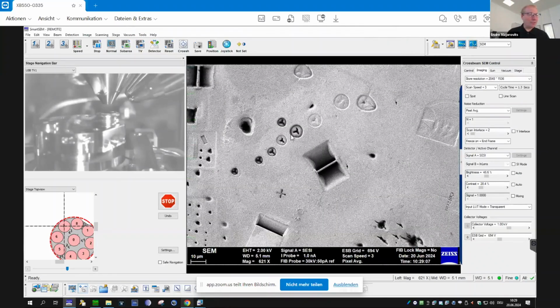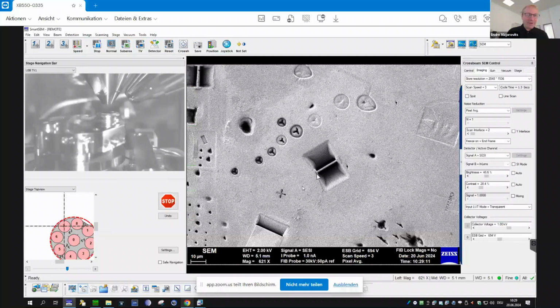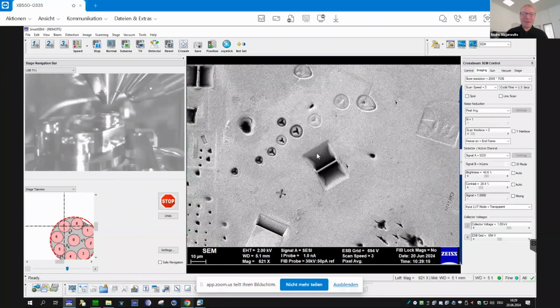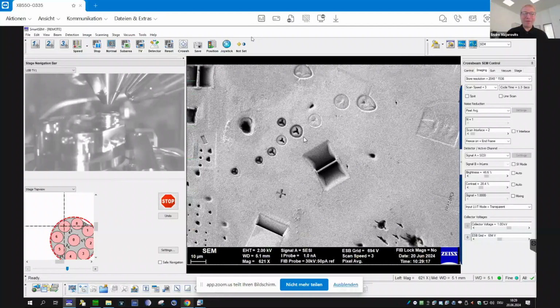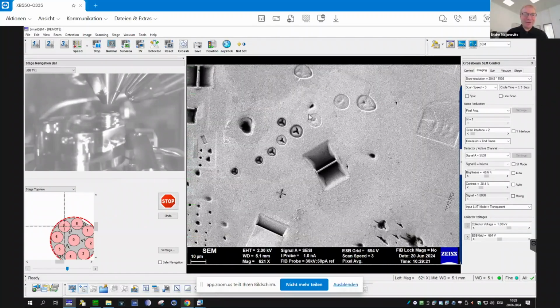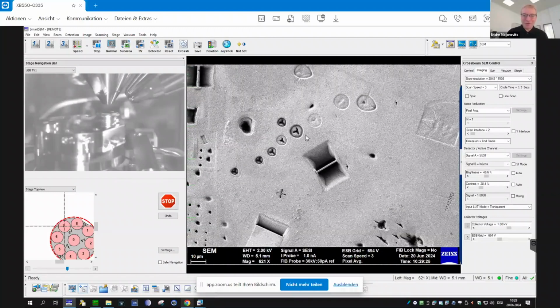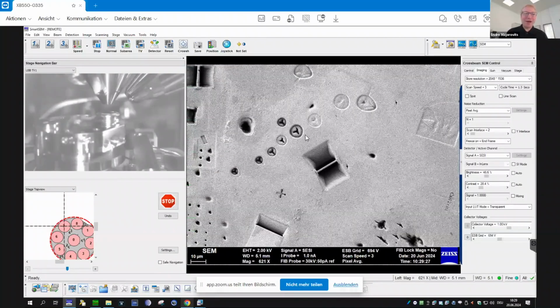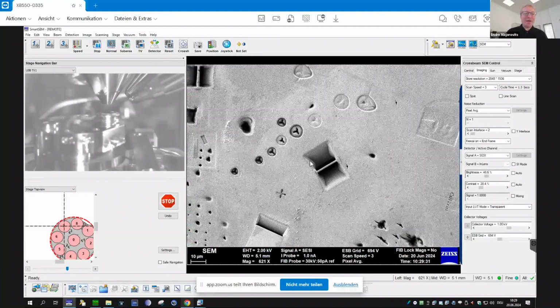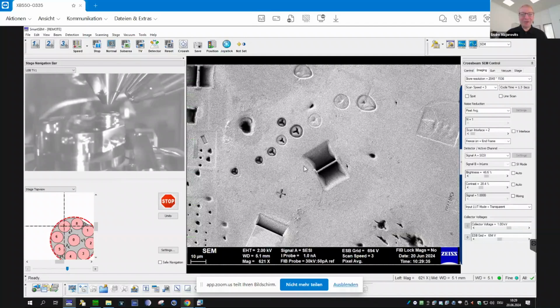Good. This is the macro. Another thing that is really helpful for remote access is that we have individual logins. So each person can log in individually to this graphical user interface. The service has a certain login. I have my login. Users have their login. And a lot of things can be transferred from one login to the other one.